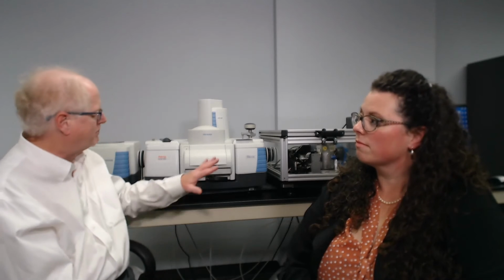And as it heats it up, the sample begins to undergo breakdown or decomposition. And the gases that come off of it are then transferred over to this module that sits in the sample compartment, and we analyze those gases. This is an extremely powerful technique for especially things like rubber, different people who make tires and materials like that, and also pharmaceuticals and other materials where you just need to understand the breakdown.